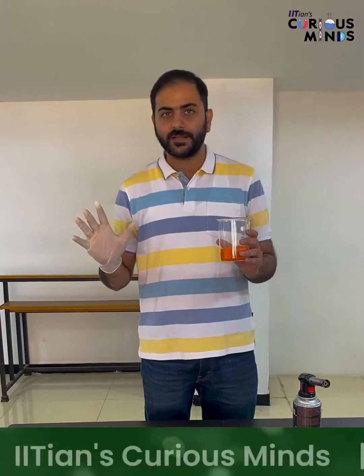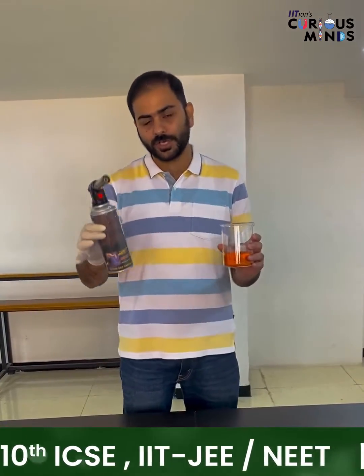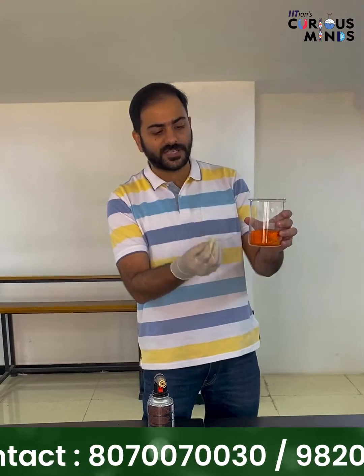Plus water. Now, a very important caution: please don't try this at home. Using this flame torch, we are going to heat it, and it is going to look like a volcanic eruption - a very slow volcanic eruption.